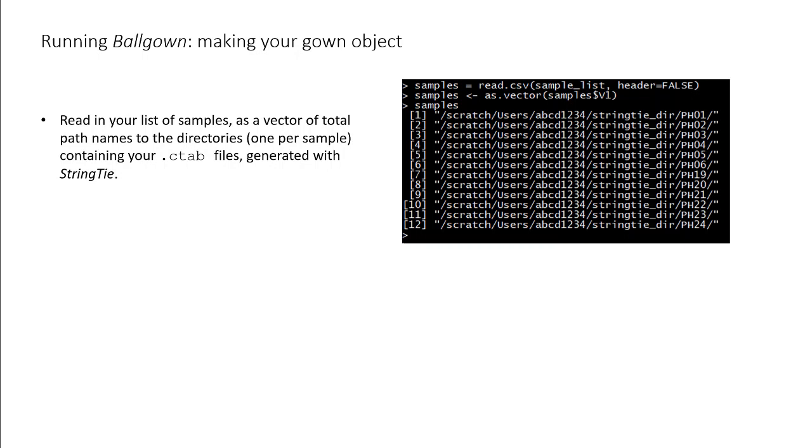Next, we must load in a list of strings that are full paths to the directories containing the CTAB files generated by StringTie. There should be one sample per directory. Here, we've loaded in a text file containing the list of paths, which we assign to the variable sample.